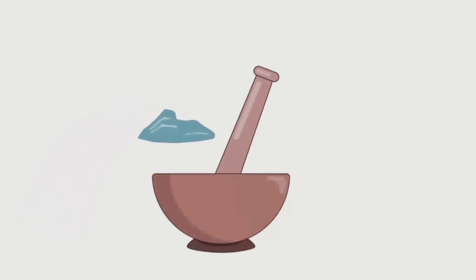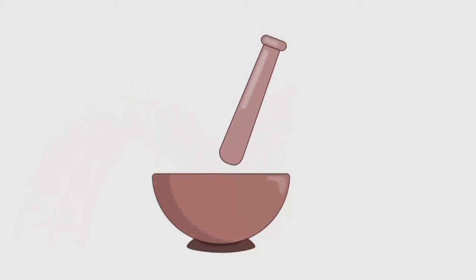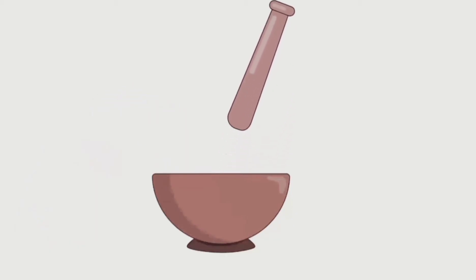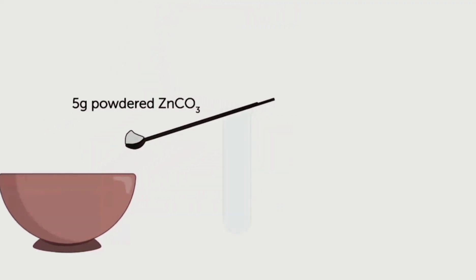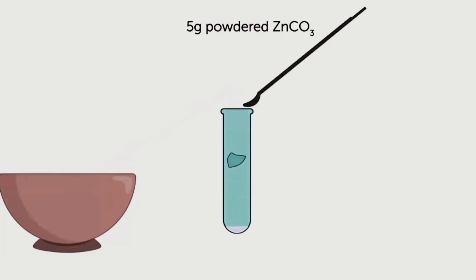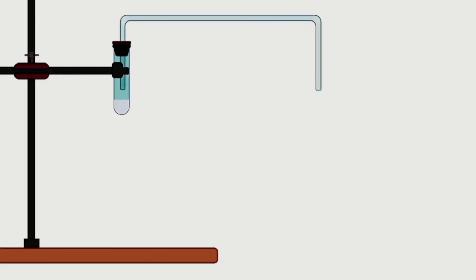Grind a small amount of zinc carbonate using the mortar and pestle into fine powder. Then take 5 grams of powdered zinc carbonate in a test tube and fix it on an iron stand. Seal the test tube with a single hole stopper. Fix the glass tube in the stopper and seal it with plaster of Paris.